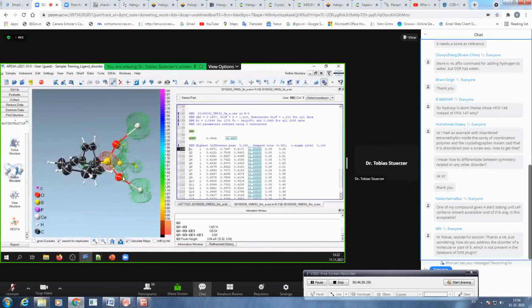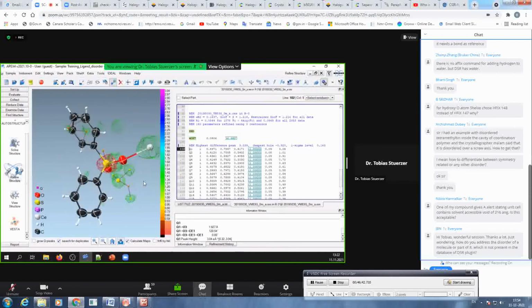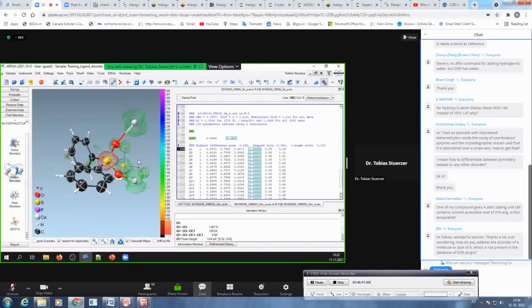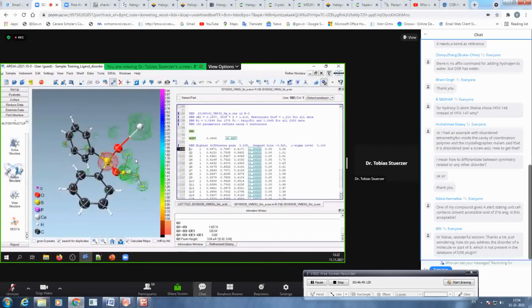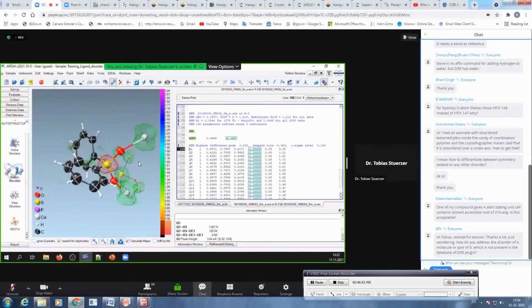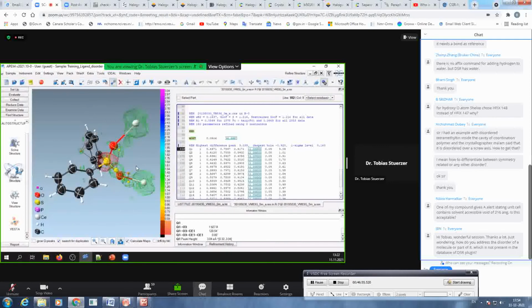And this tells me, since the geometry of these 3 Q peaks is the same as this, that there is a second orientation of the same ligand, yeah? Which would make to some extent also chemically sense. Yeah. Okay, how to model that?